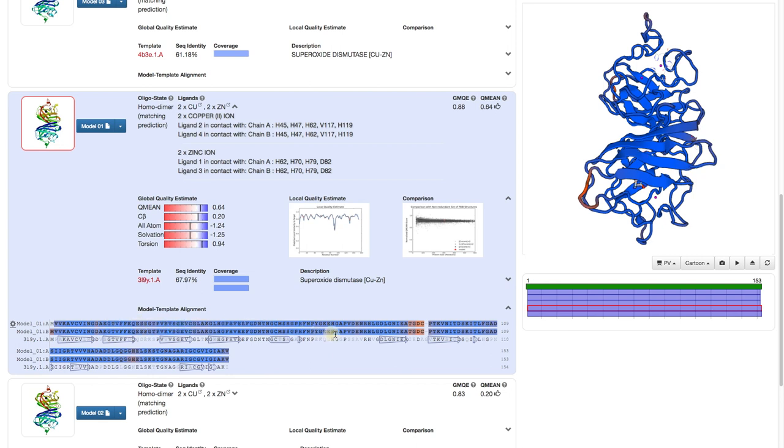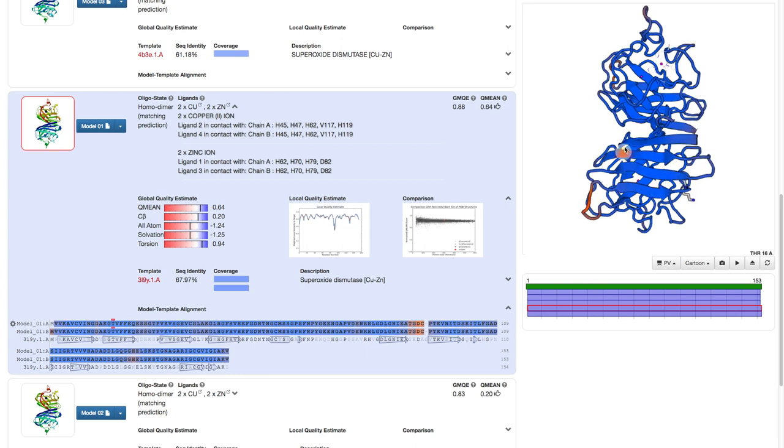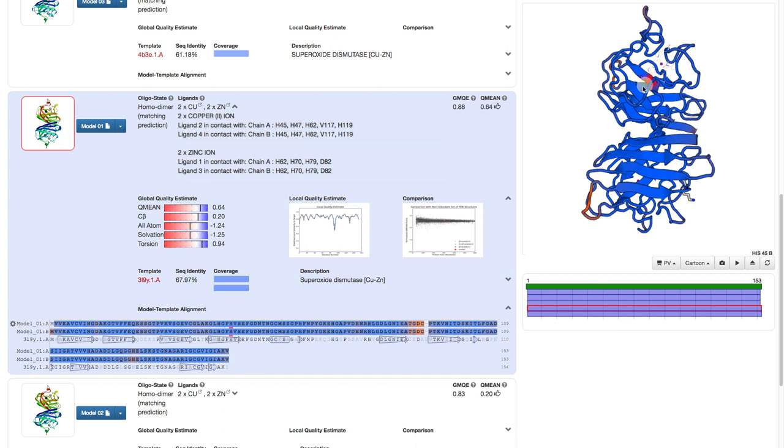We see right away that the beta barrels and the protein-protein interface is modeled with high confidence. The same is true for the binding site of the copper, and to a lesser extent the zinc binding site. While these loops seem to have a lower confidence.